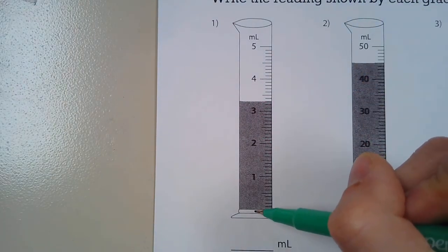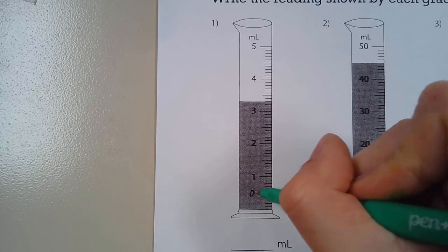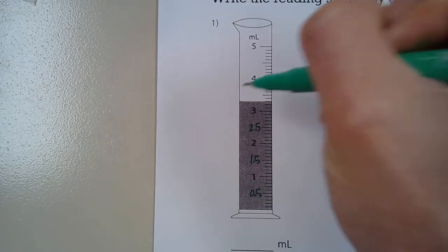Between zero and one, halfway between zero and one would be 0.5. And so this would be 1.5, this would be 2.5, this would be 3.5, this would be 4.5.